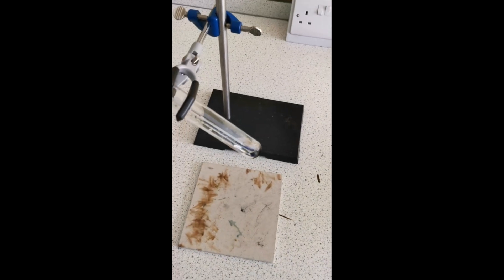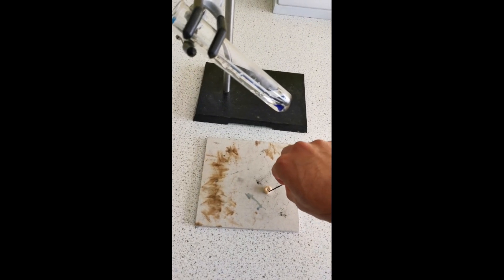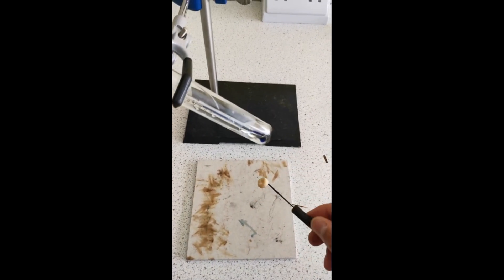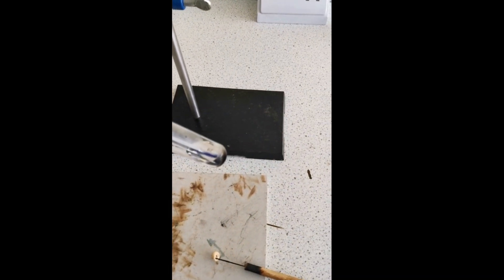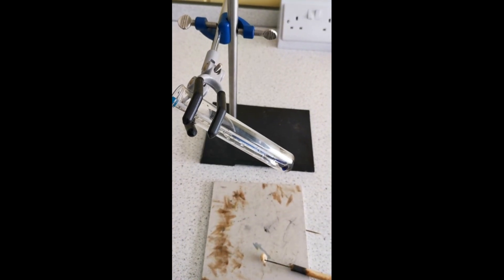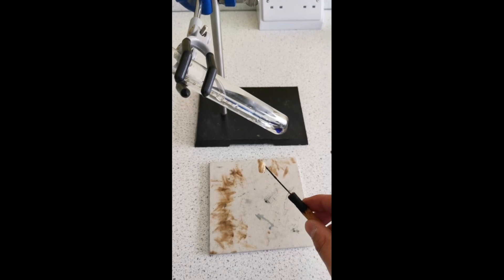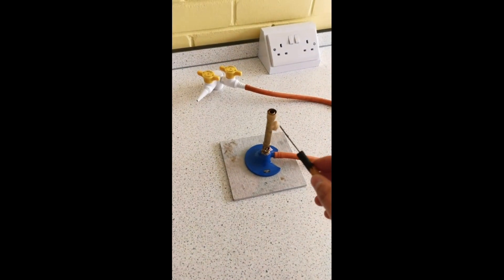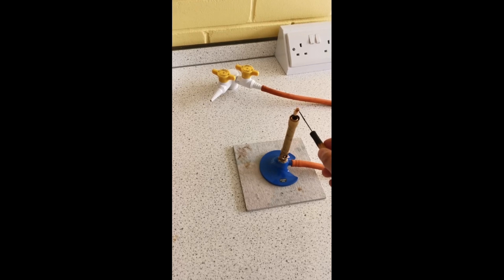Now we're ready to burn our first food sample. You want to get your food sample and push the mounting needle through it so it's firmly attached. Then you want to record the starting temperature. Don't forget to do this. Ours was 24 degrees Celsius. Now you want to set the food on fire using your Bunsen burner.